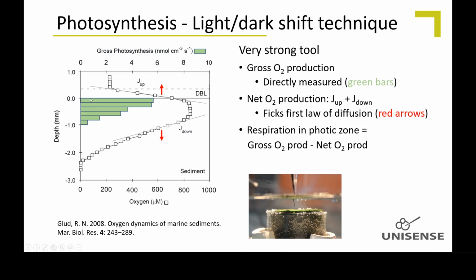No, in this case, I would want the 1, 2, 3, 4, 5, 6 intervals. Is that right? Yes, between 0 and 1 millimeter. The sensor has been in the center of each interval here, and then we assume that represents the interval thickness. That's why we can make a bar graph, so to say.